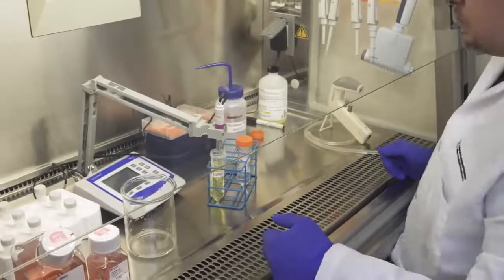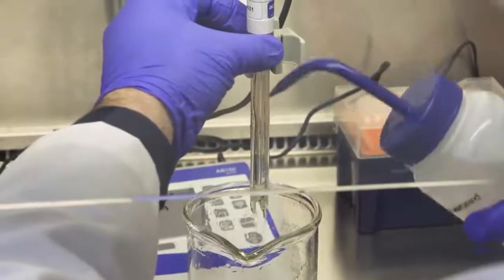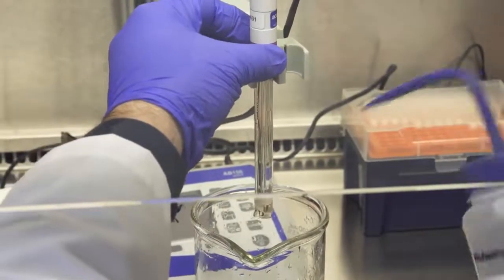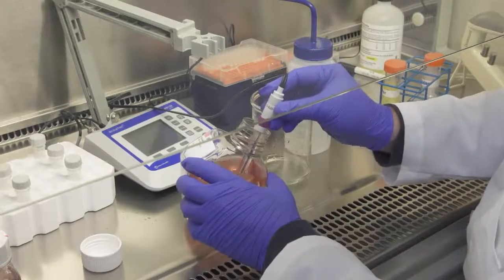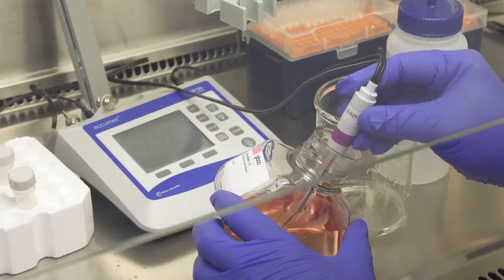To start, prepare the transfection buffer using 500 milliliter and 100 milliliter room-temperature pre-warmed bottles of fresh, reduced serum medium. Measure the base pH of the medium in the 500 milliliter bottle by inserting the pH meter's glass electrode into the buffer and wait up to one minute before reading the pH.